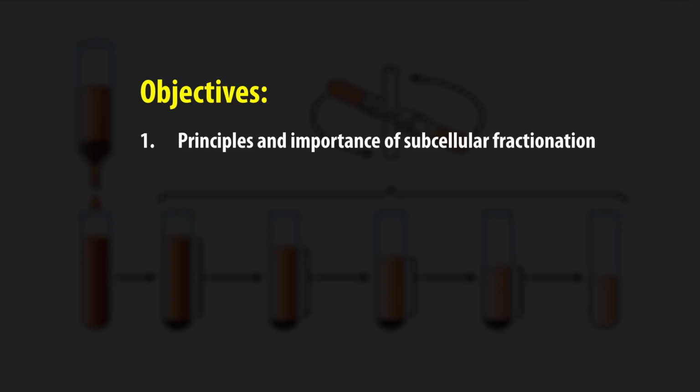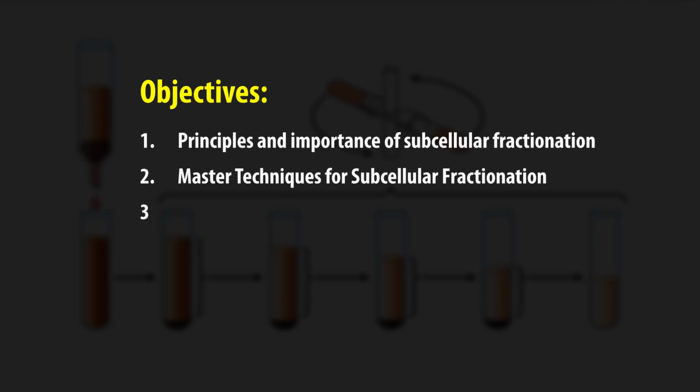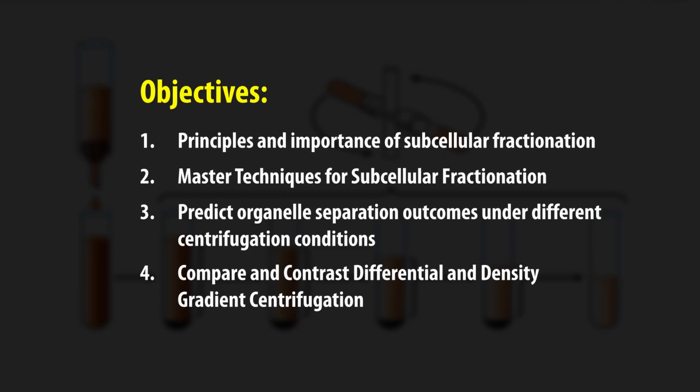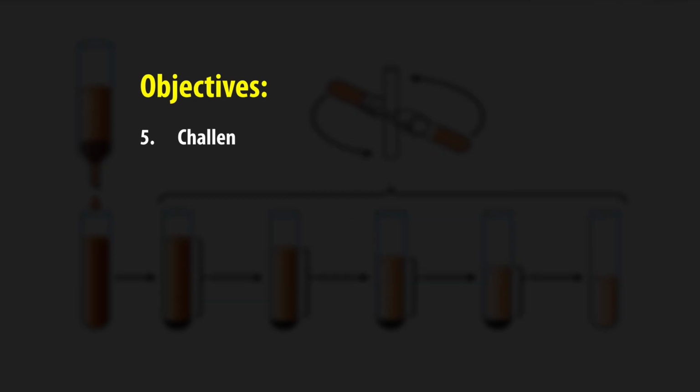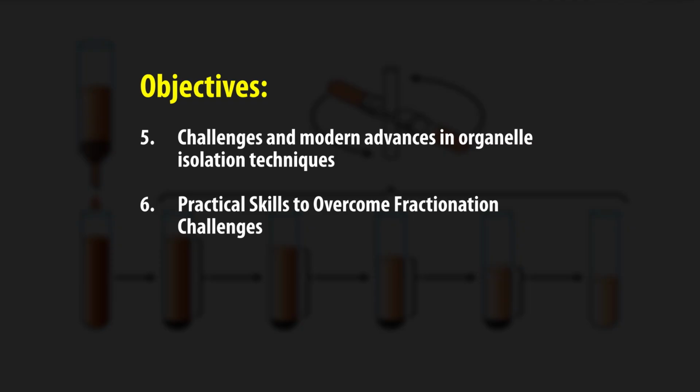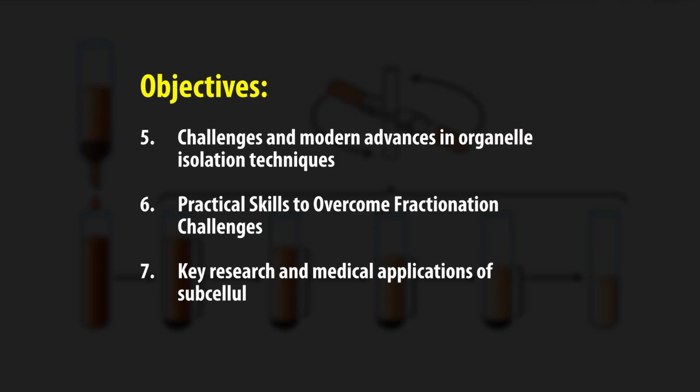of subcellular fractionation, master techniques for subcellular fractionation, predict organelle separation outcomes under different centrifugation conditions, compare and contrast differential and density gradient centrifugation, recognize challenges and modern advances in organelle isolation techniques, apply practical skills to overcome fractionation challenges, and identify key research and medical applications of subcellular fractionation.